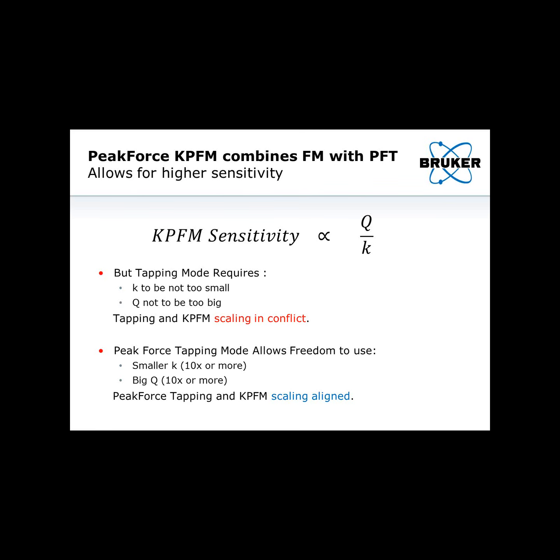So the problem with tapping mode is that it kind of works against you for your KPFM sensitivity. And so you would prefer to use a tip that optimizes this ratio, and you can't really do that very easily with tapping mode. So the scaling is in conflict.